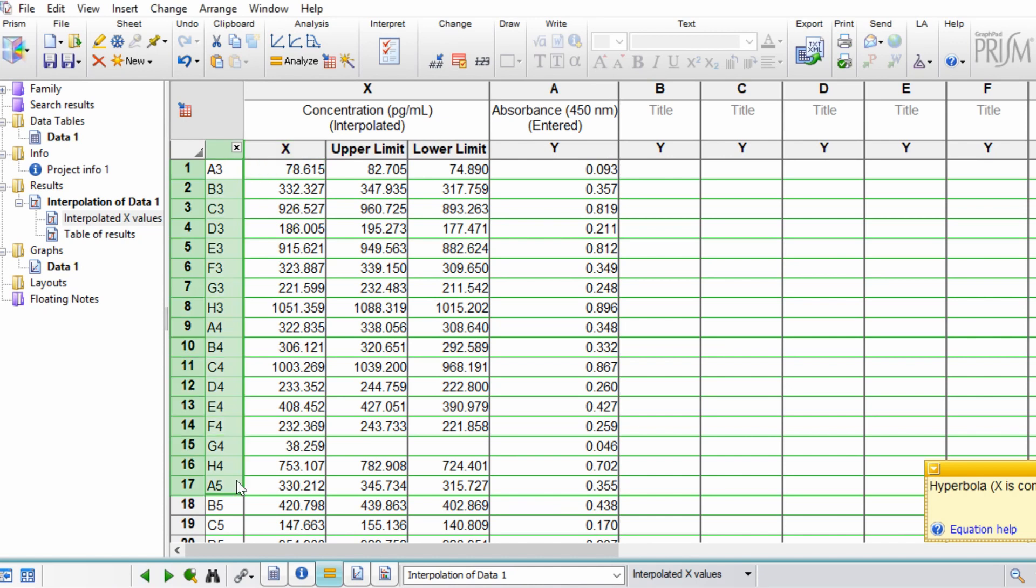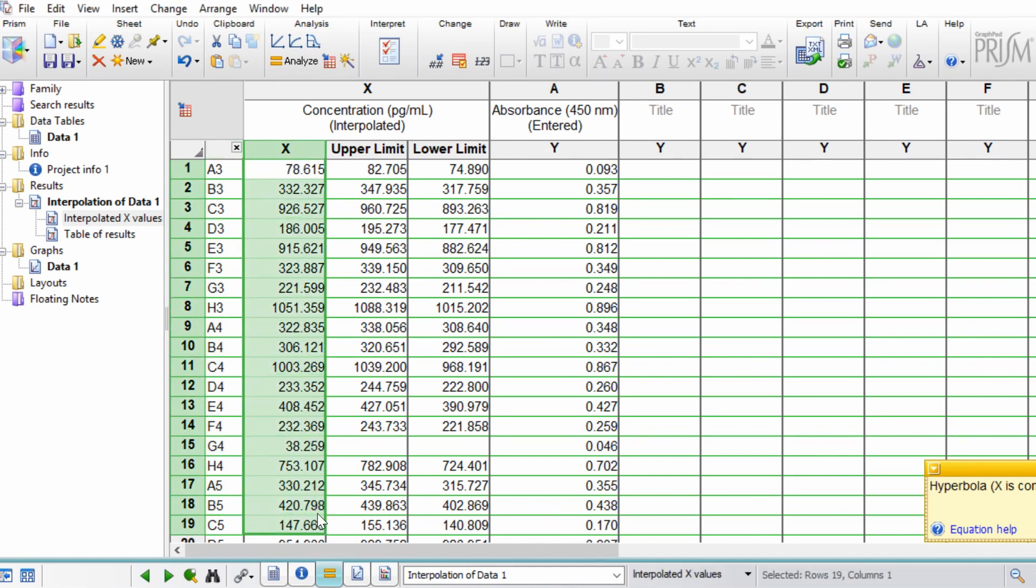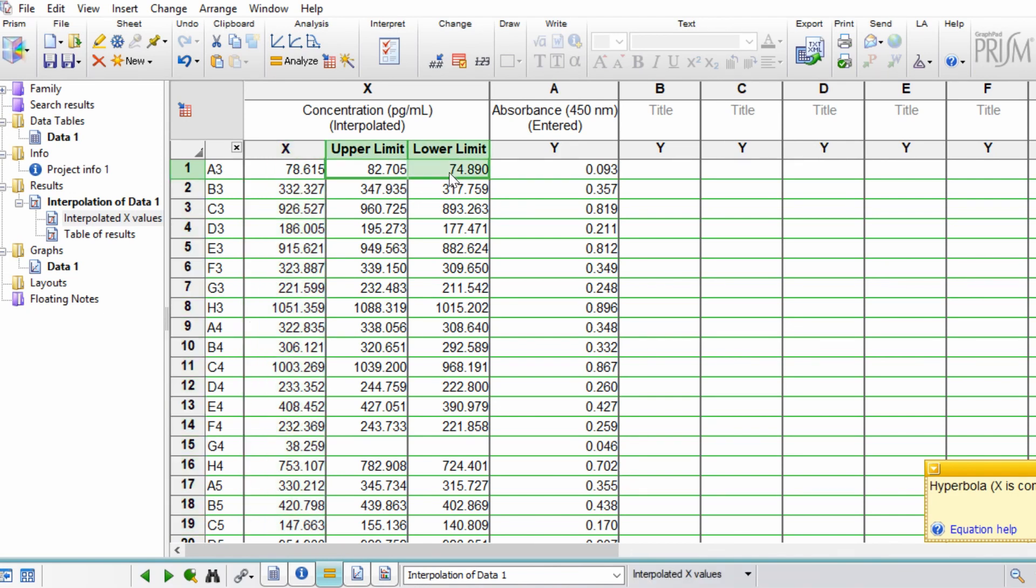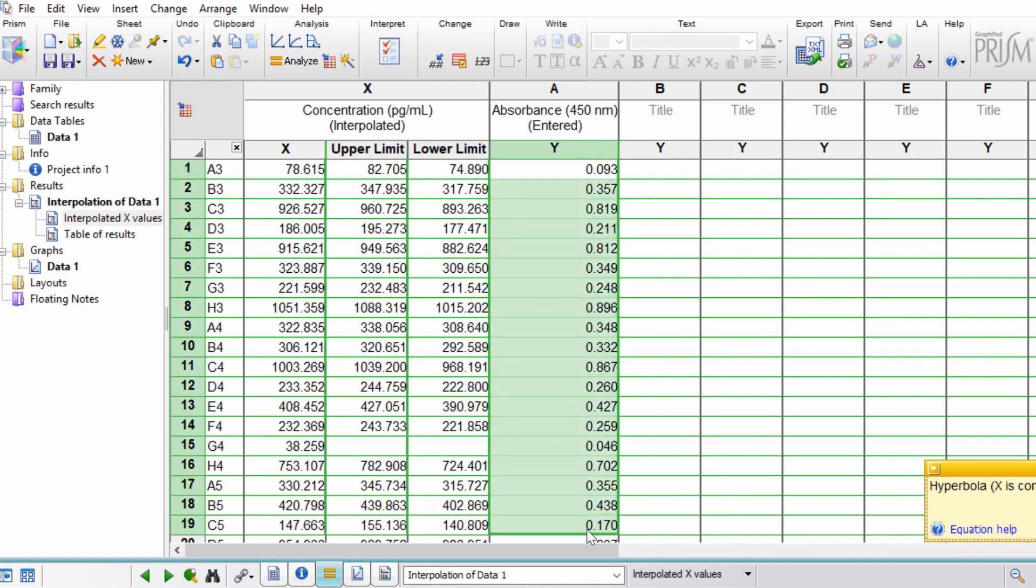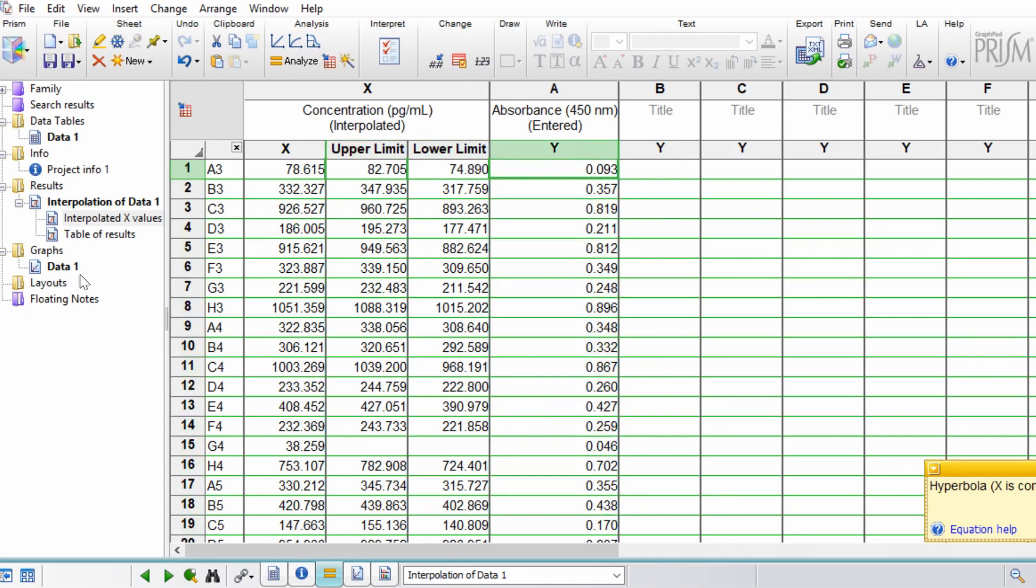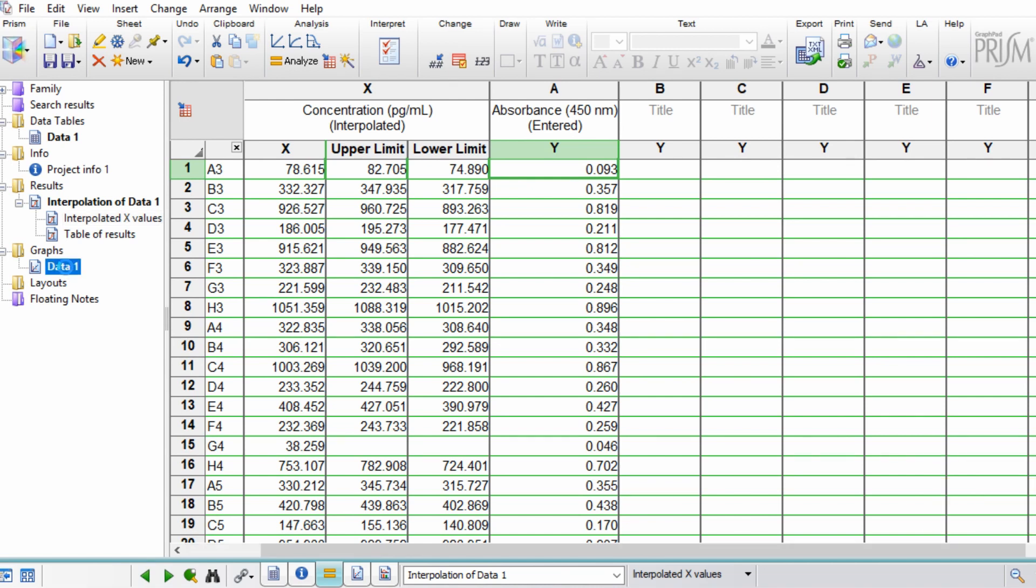You also have the 95% confidence intervals for each of these samples, and the Y values were the known absorbance values that we entered. And then if you go to the graphs sheet that's been created, you'll see that my standard curve follows the hyperbola relationship quite well.